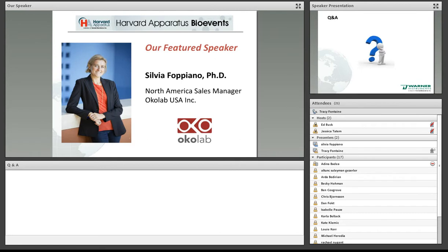Can you go into a little bit of what's the process for fitting a microscope? So when one decides to purchase a cage incubator system, we send a questionnaire, because we need to know not only the microscope brand and model, but also what peripherals are connected to it and in which location.